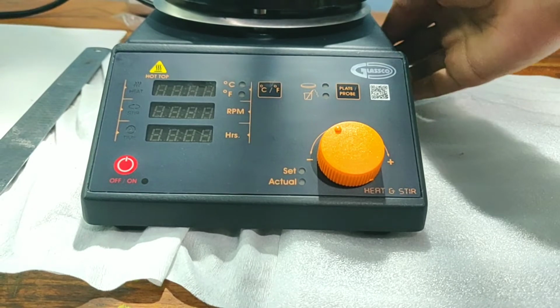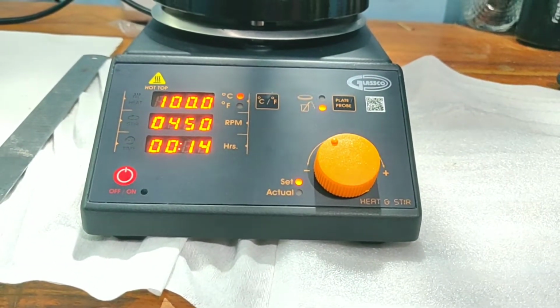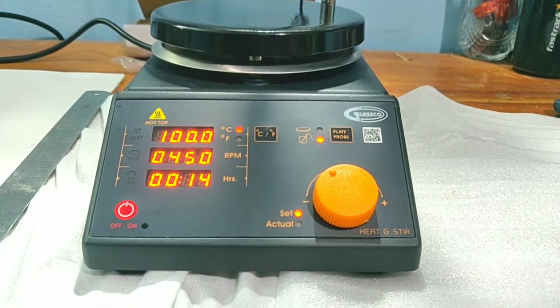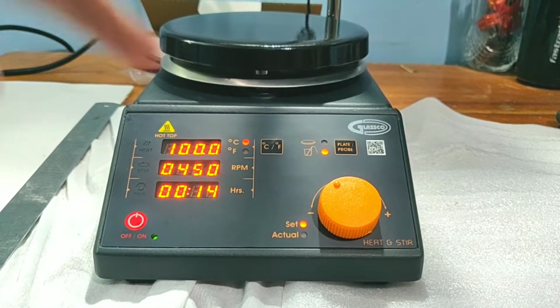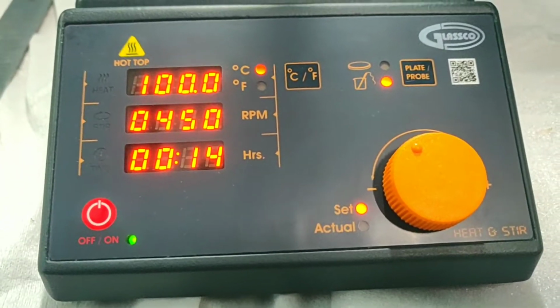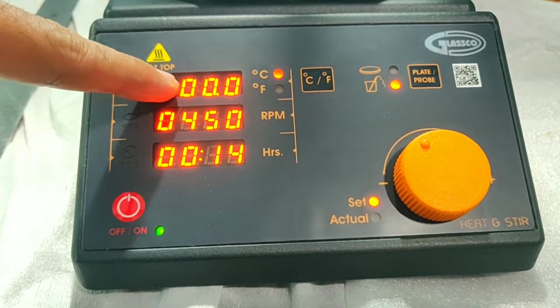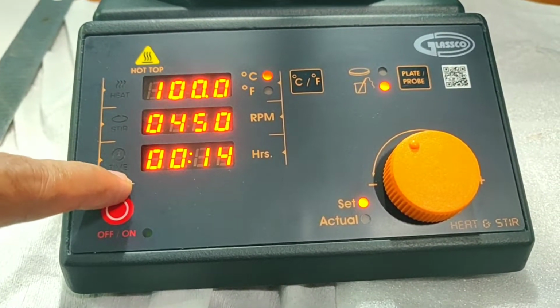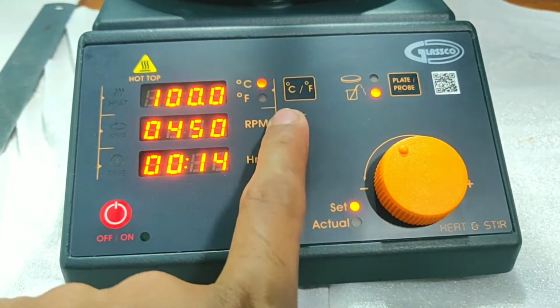Let us switch on the hot plate, and it is now on. Don't mind the blinking of the light, it's actually the fault of my camera. First of all, we have to set the hot plate before just running it. The first thing to do is to set the temperature. Here is the temperature reading. The second thing is the speed, and third is the duration of the functioning of the hot plate.